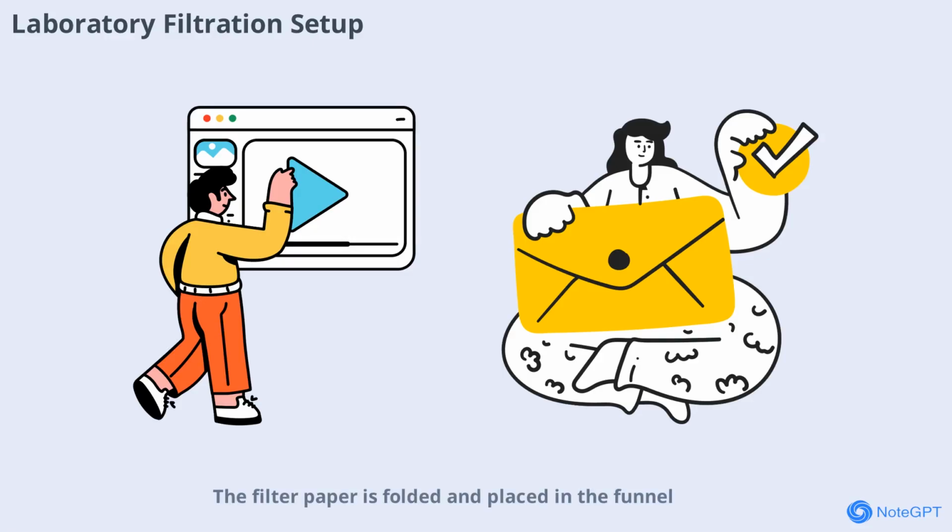The filter paper is folded and placed in the funnel, which is then set above the flask. The mixture is poured into the funnel, and gravity or vacuum pulls the liquid through the filter. Proper setup is essential to prevent leaks and ensure efficient separation. Attention to details such as wetting the filter paper before use can make a big difference in the outcome.